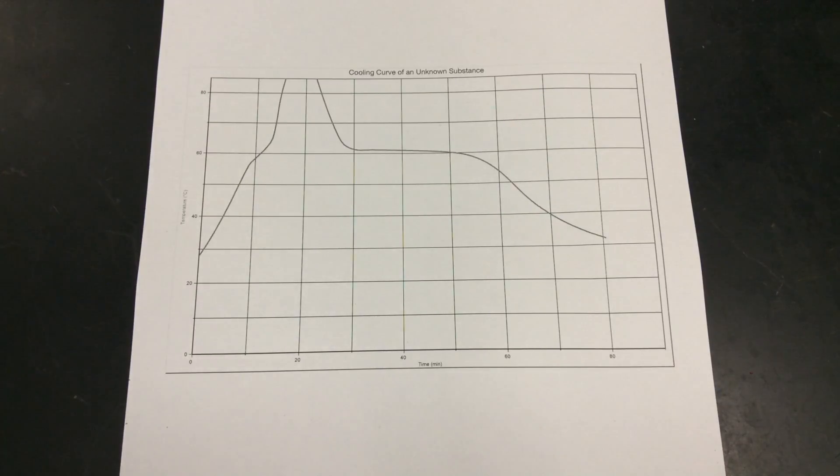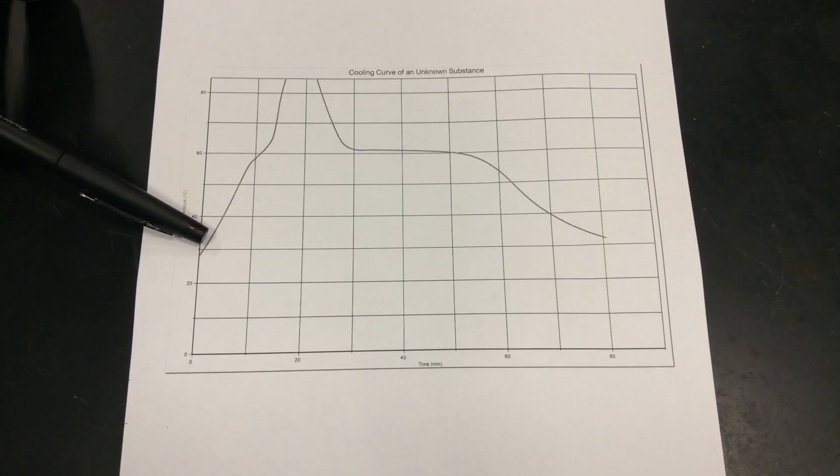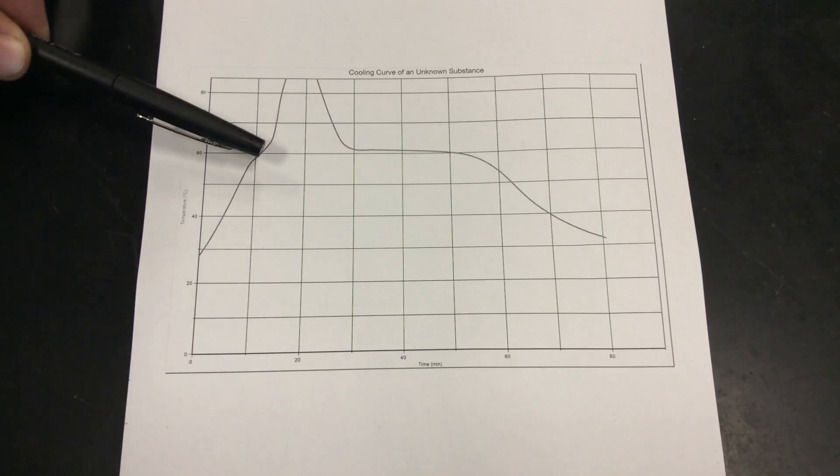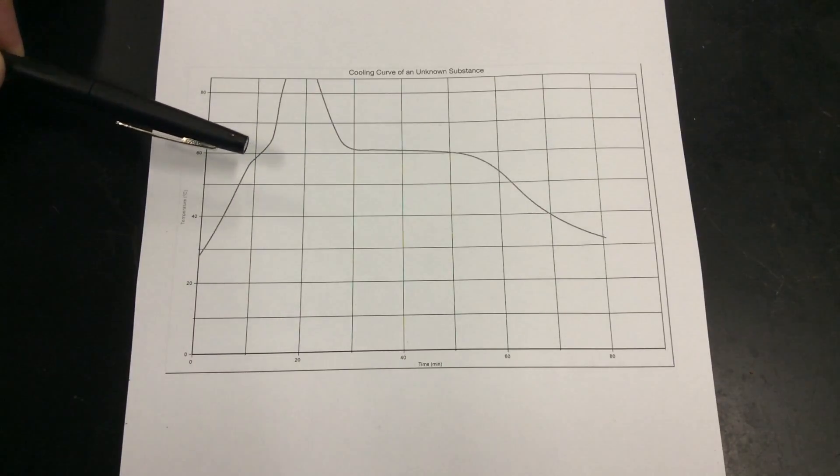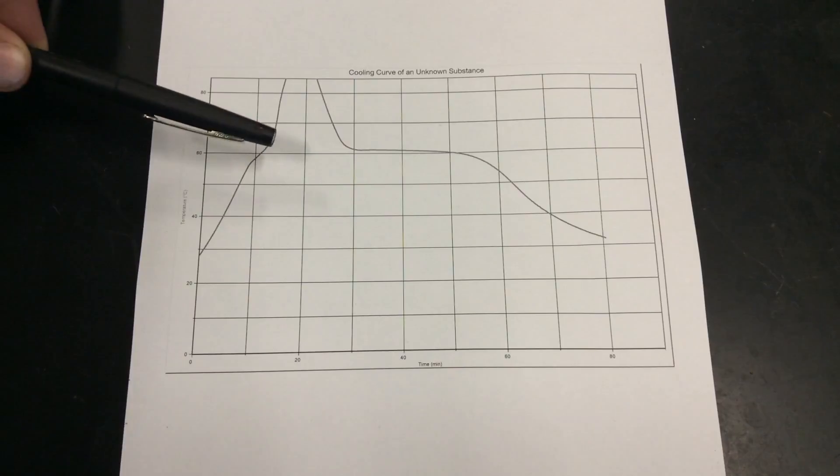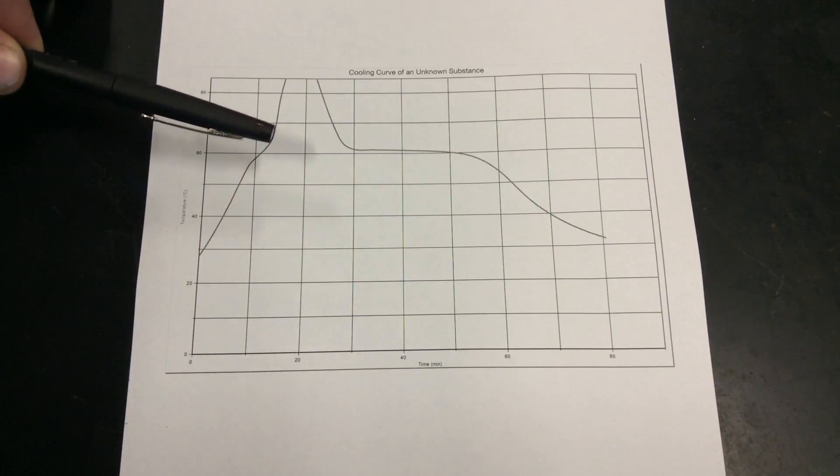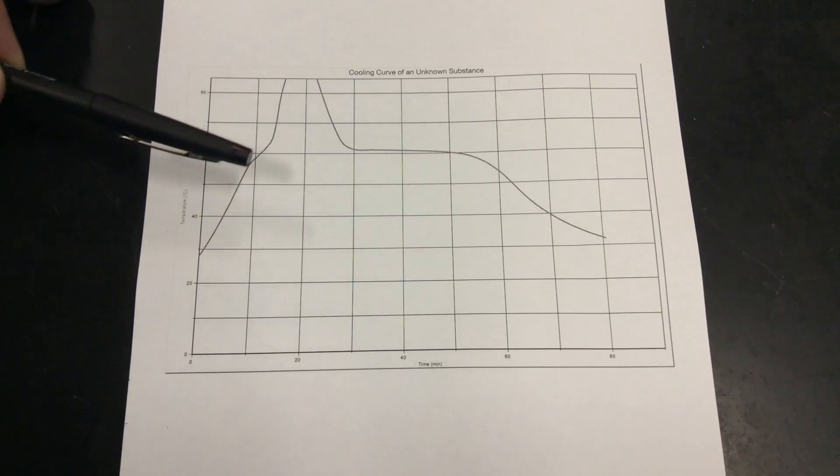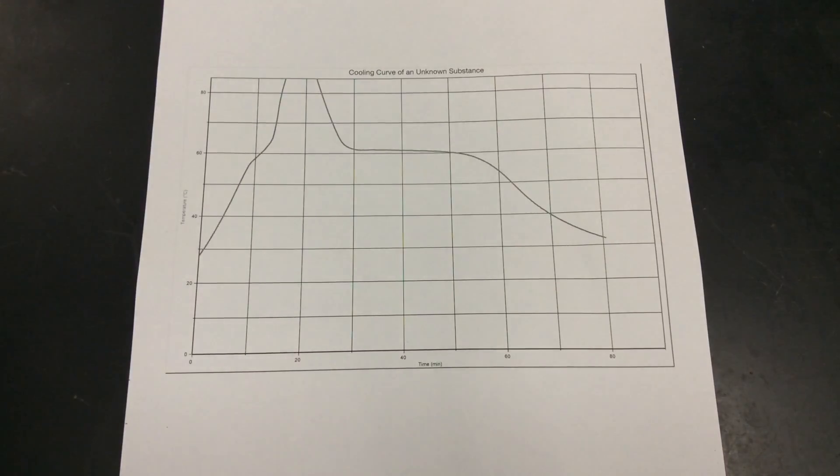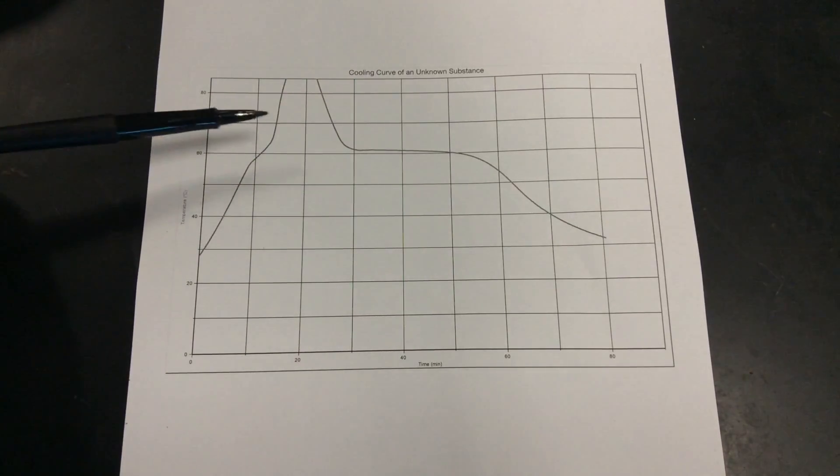If you look carefully in our curve here, we can see that we're dealing with something that's probably below its phase change temperature. If you look here, we have sort of a flat lining here. It's not great because too much energy was being consumed by the thermometer. It couldn't handle the heat. It looks like here is giving us an indication that a phase change is happening here, and then it flies up again. This little area, this little indentation, you should recognize was our phase change. It wasn't nice to observe.